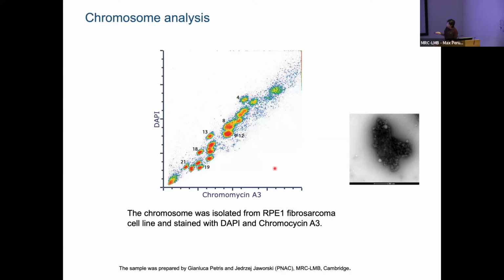So we started doing chromosomes a couple of years ago. And apart from Sanger, as far as I know, there is only us doing chromosome analysis. We particularly purchased a 445 nanometer laser line to do chromosome analysis.